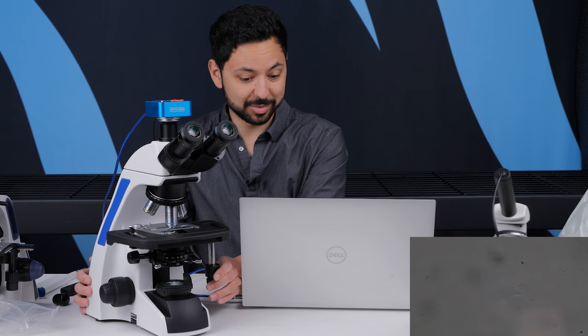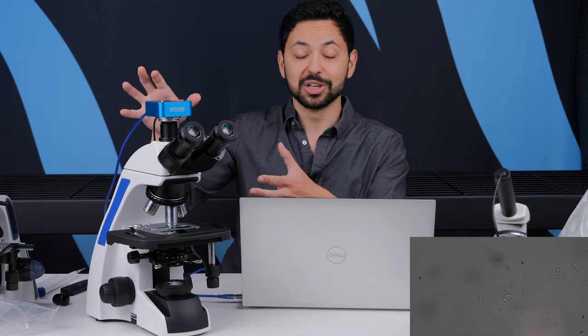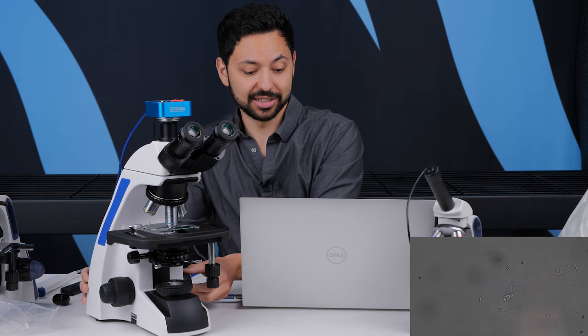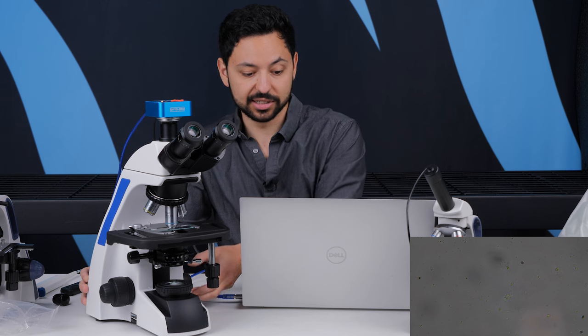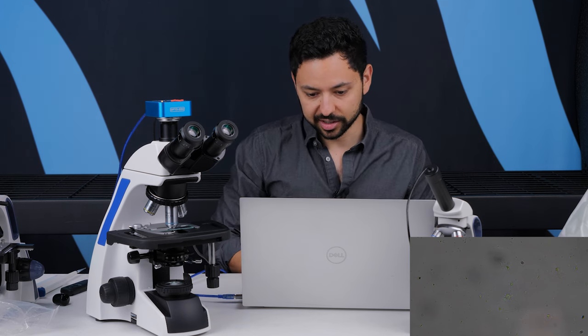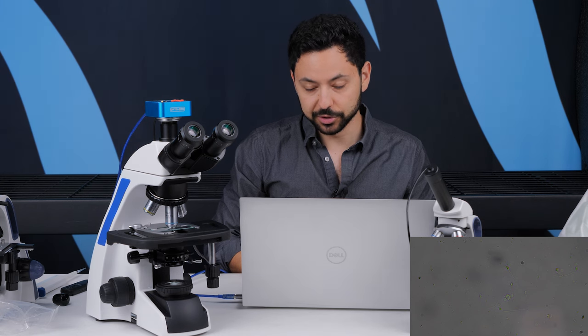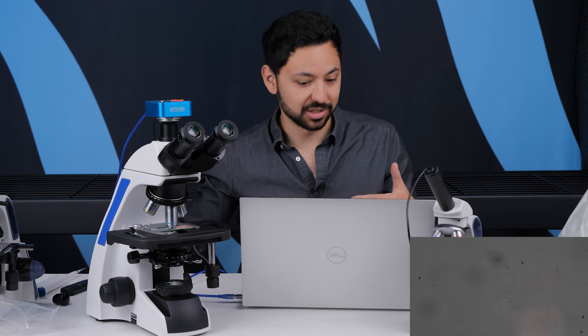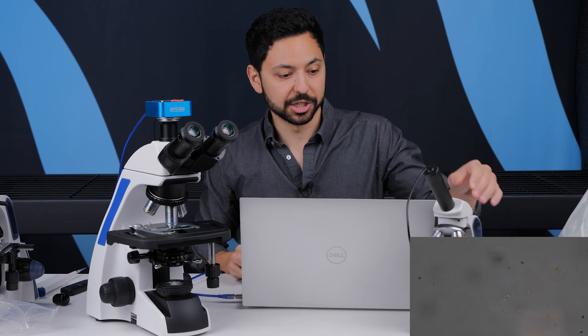So, I mean, admittedly, this doesn't actually look all that much better on a significantly more expensive microscope. And it really comes down to the way that you're lighting up the sample. I think in this case, that's the most important part. Of course, this microscope makes regular samples look a lot better than this other much less expensive microscope does. But in this very particular case, you can get away with a pretty inexpensive microscope as long as you have it set up correctly. I mean, this is definitely higher quality, but not by a substantial margin. And if you do want to get to kind of the next echelon of image quality, you're going to be looking at getting a phase contrast microscope, which is minimum $2,000. What we're really trying to achieve with the sperm observation kit is to give you 80% of the value at a tenth of the price.